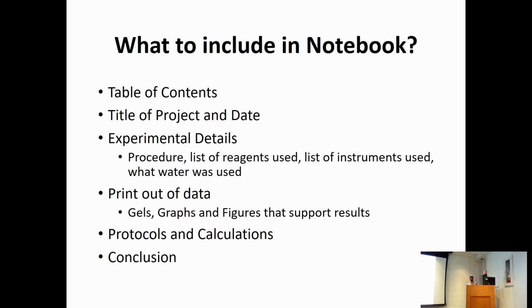You should know which chemical you used for your experiment, so that the next time you use it, it will give you the same results. Otherwise, if it is from a different manufacturer, sometimes a certain impurity in it might cause a problem. So the best thing is, whenever you document everything, you should have the manufacturer's name and also the catalog number of that reagent. That's better.